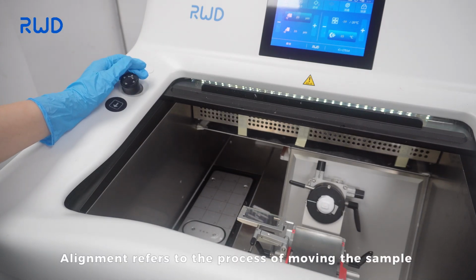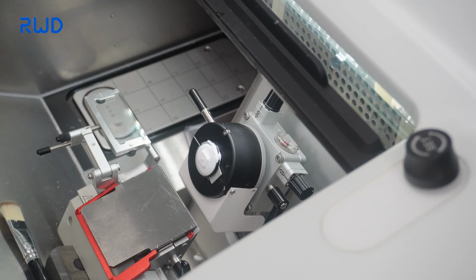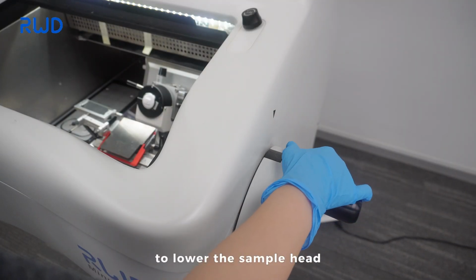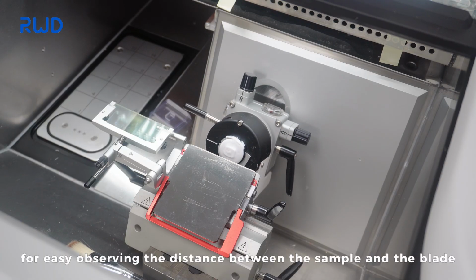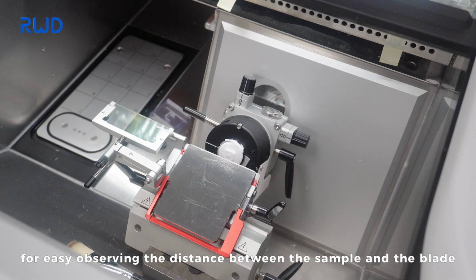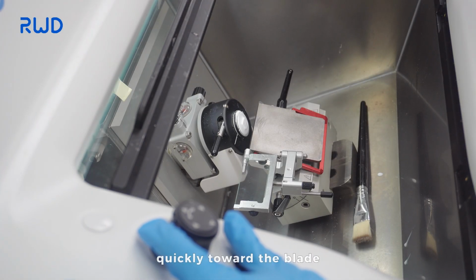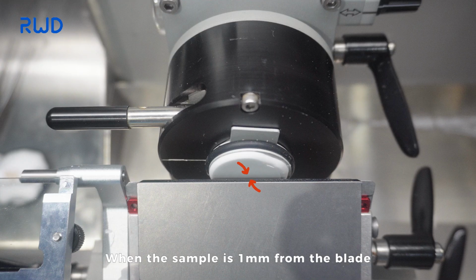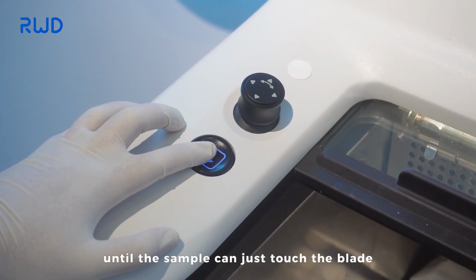Alignment refers to the process of moving the sample head closer to the blade. Before alignment, unlock and turn the handwheel to lower the sample head, for easy observing the distance between the sample and the blade. Toggle the joystick to move the sample head quickly toward the blade. When the sample is 1 mm from the blade, press the stepping button until the sample can just touch the blade.